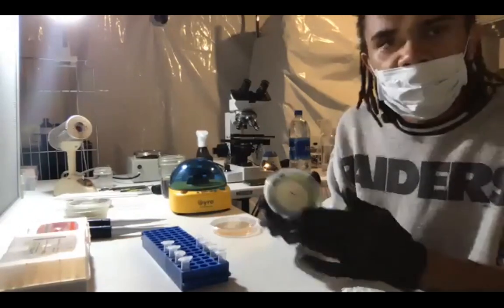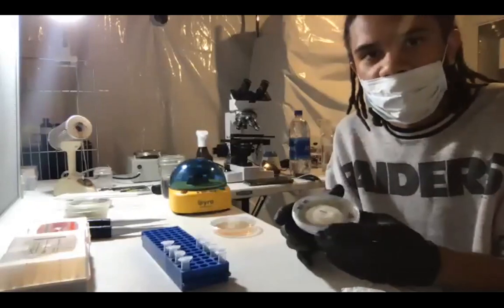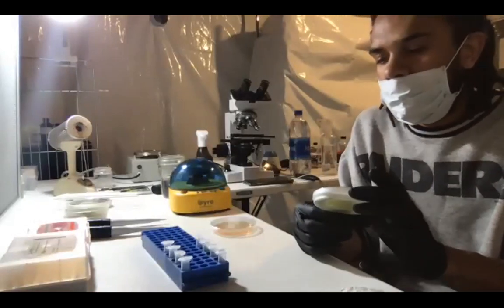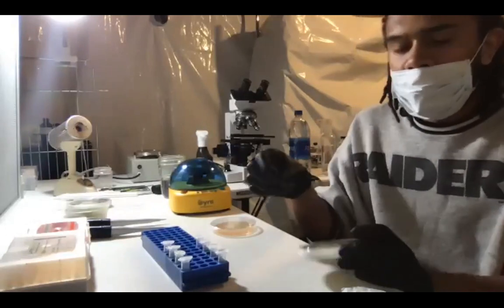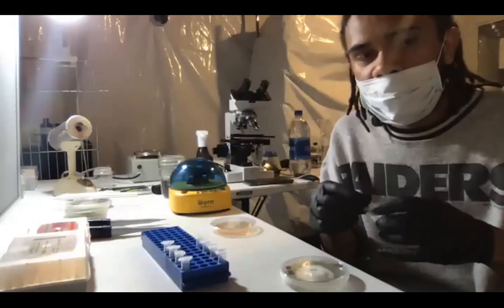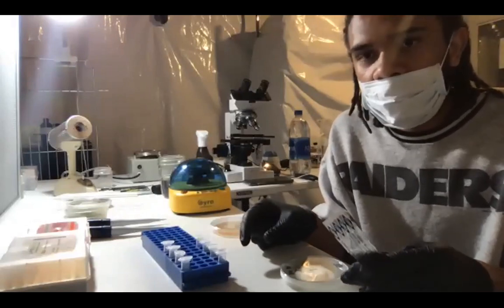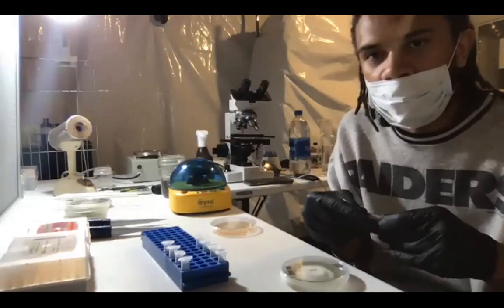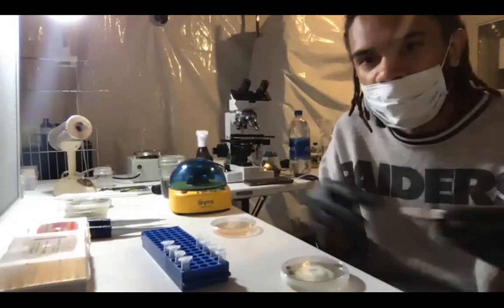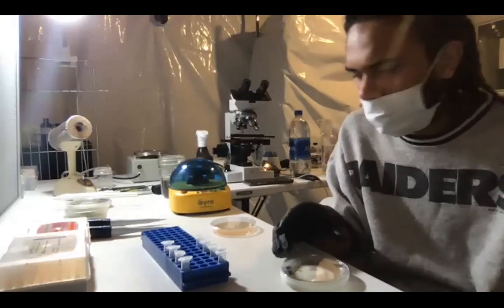For the rest of these, I'm not gonna show you up close, because moving it around outside of the petri dish is a potential for contamination, which isn't the biggest deal with this. Because the primers that I'm going to be using to isolate the mating type genes only work for this mushroom. There aren't any other bacteria or anything that can contaminate this that these primers will work for. The genes that the primers select are specific to Cordyceps militaris.